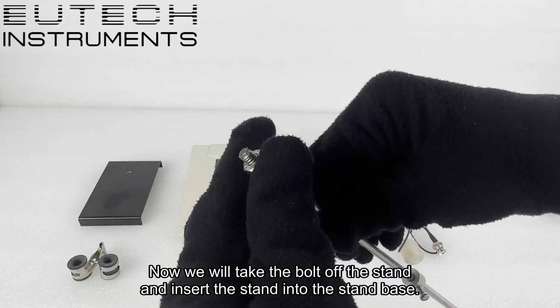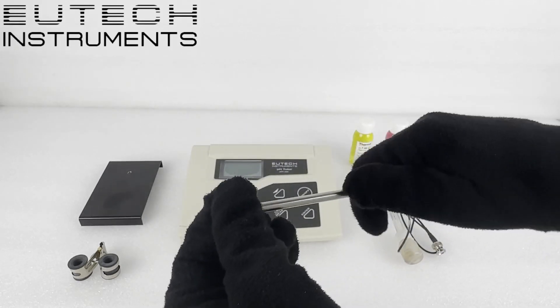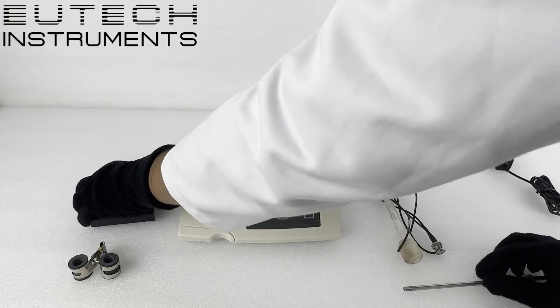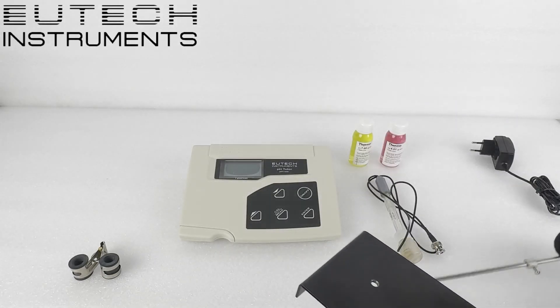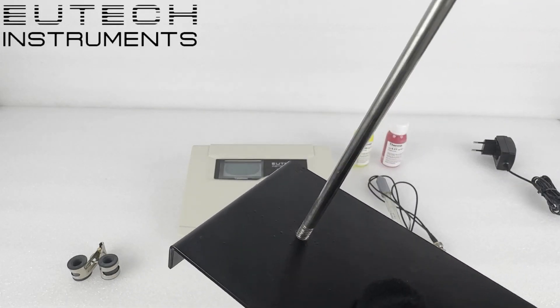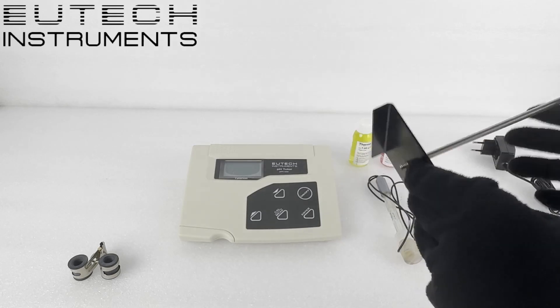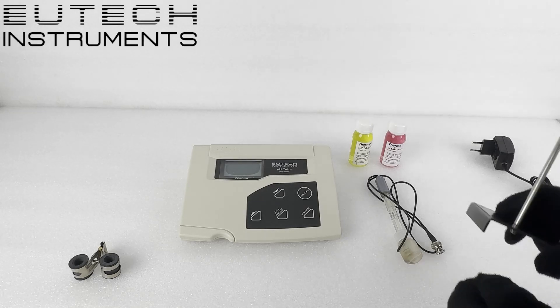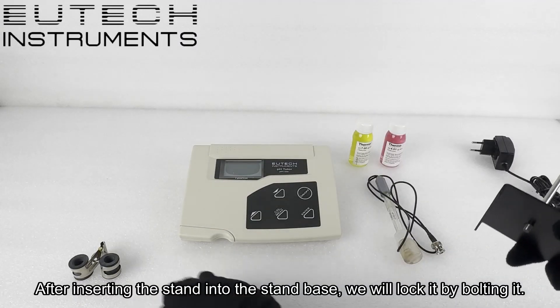Now we will take the bolt off the stand and insert the stand into the stand base. After inserting the stand into the stand base, we will lock it by bolting it.